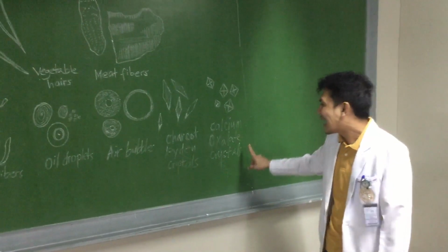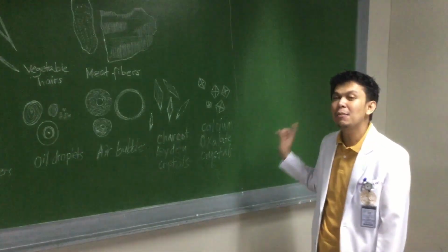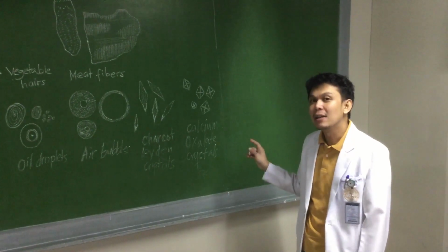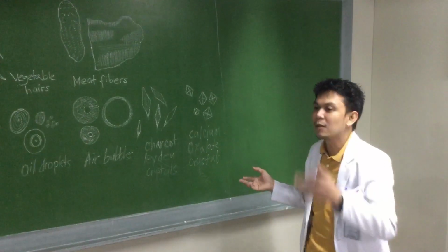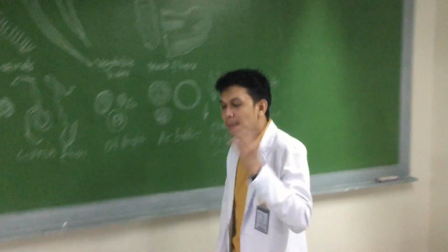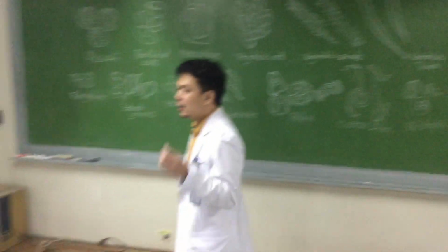And also, calcium oxalate crystals, especially if the stool is contaminated with urine. Okay, na may yung uric acid, calcium oxalate, makakakita kayo nun. So therefore, ang dapat iwasan, okay, is to contaminate the stool sample with water or urine, lalo na kung urine, at saka ibang chemicals.